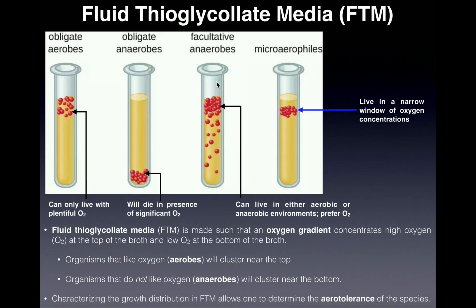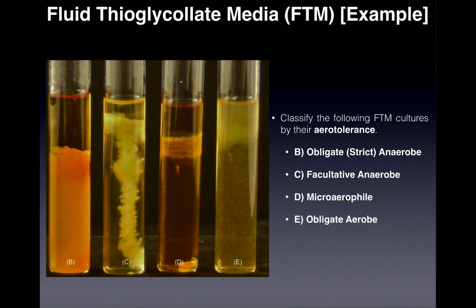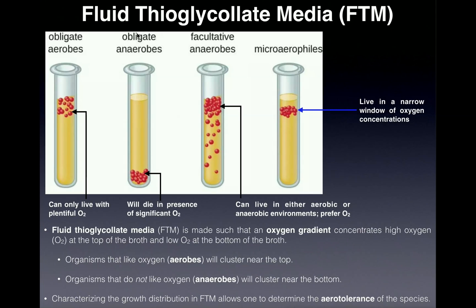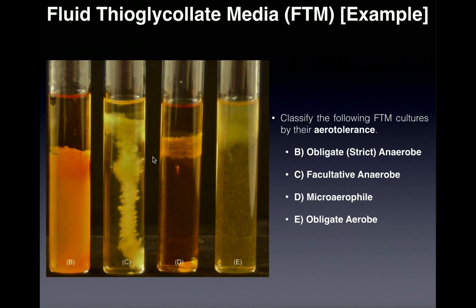Now let's look at some real tubes you might see in the lab. This first one, tube B, is an obligate or strict anaerobe. In FTM, the top one-third has oxygen and the bottom two-thirds is more anaerobic. You'll see growth in the bottom two-thirds, with absolutely none in the aerobic region at the top. That growth only in the bottom two-thirds is characteristic of an obligate anaerobe, also called strict anaerobe.